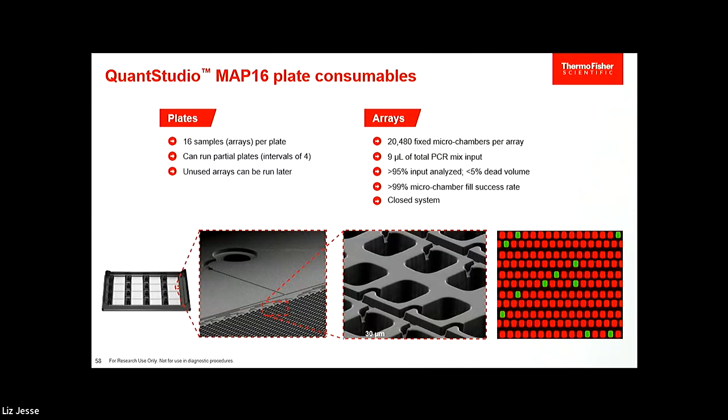I would like to say for anyone in the room that has done qPCR, you may or may not have utilized ROX in your master mix. So in qPCR, ROX is used as a normalizer, which means that we use it to kind of monitor how much material you had in there in the reactions. We kind of even them out if you got more master mix in one or less in another, or if you're trying to make sure that the efficiency is the same, it's used as a normalizer.